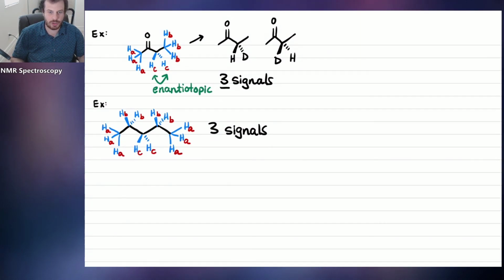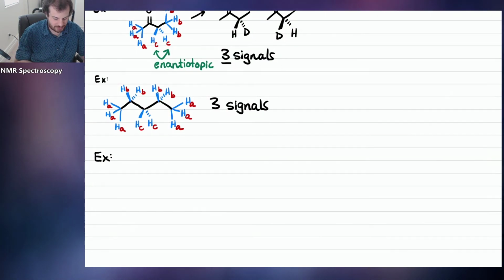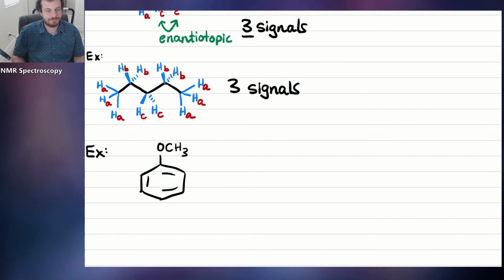All right, let's do one more just for fun. How about this compound here? Okay, let's draw in all the hydrogens. Okay, we've got our 3 hydrogens up here.